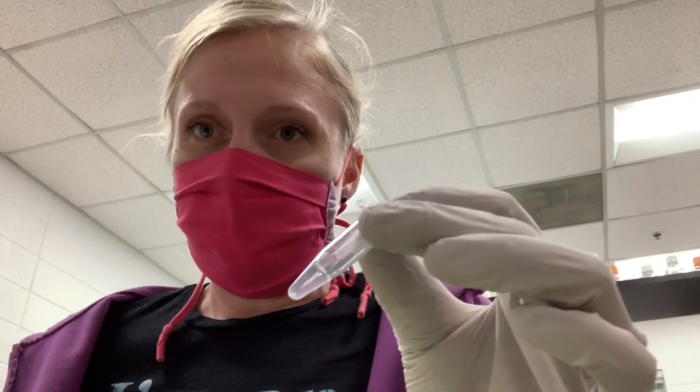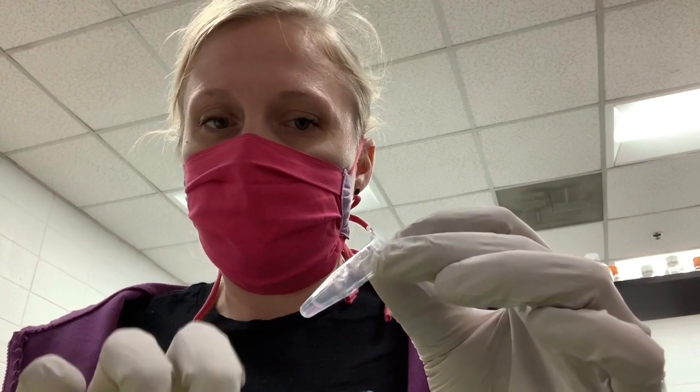Okay, so I've added everything for my master mix. I'm going to just flick it a little to have it mix up. And then I'm going to add my master mix to each tube. If you look at the reaction volume, the total volume is 20 microliters and the template is 10.5. So you'll add 9.5 microliters of your master mix to each tube, and then come back and add the 10.5 microliters of template DNA to each tube.